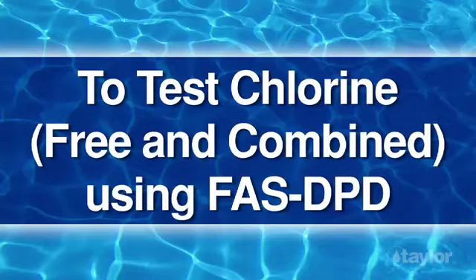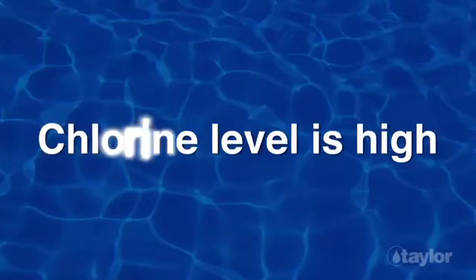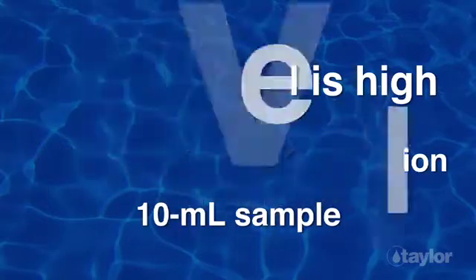To test free and combined chlorine using FAS-DPD, first decide which drop equivalents to use. If you suspect the chlorine level is high, perhaps because the water has been shocked recently, use 1 drop equal to 0.5 parts per million and a 10 ml sample. This will save time and titrating reagent.